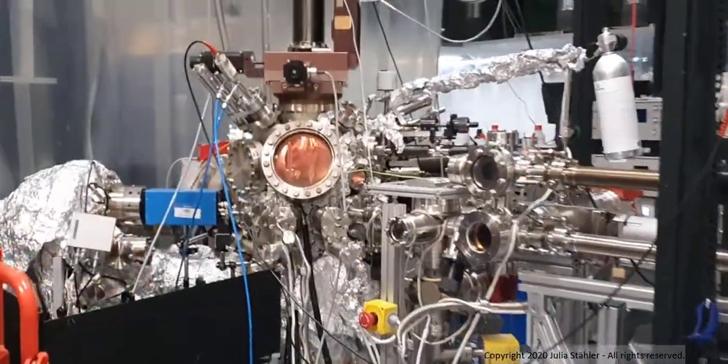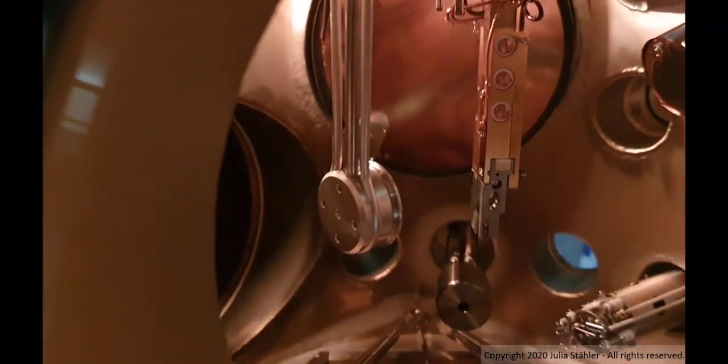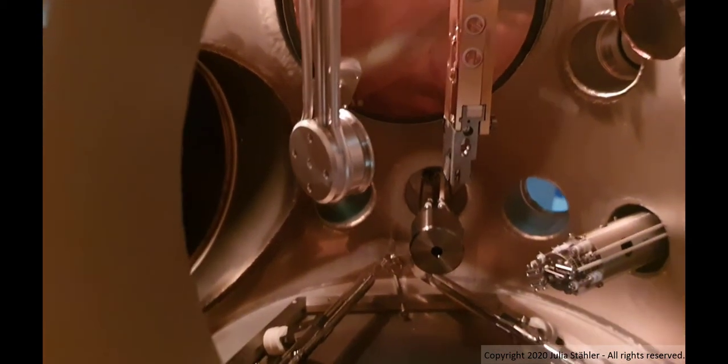Inside this chamber, there is basically nothing. Well, actually, there are many instruments in the chamber, but I will introduce these another time.